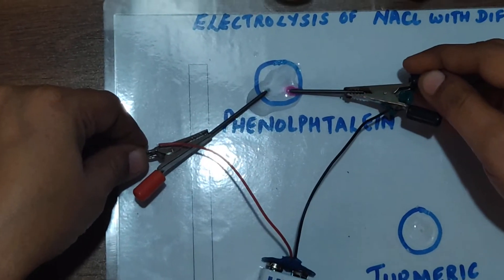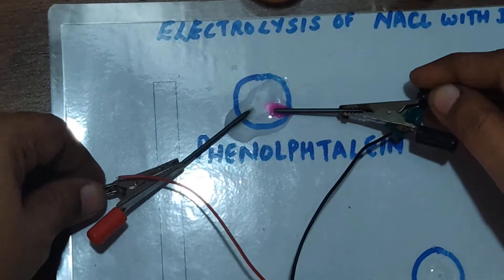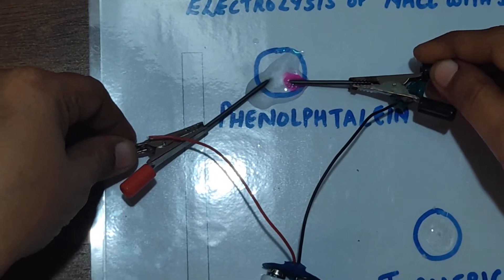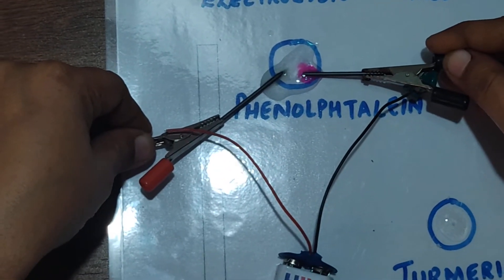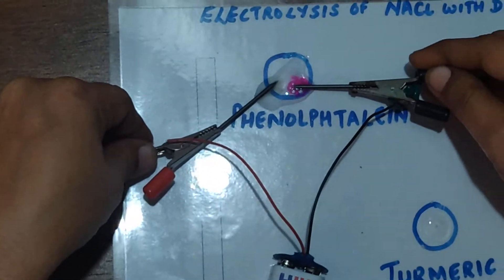See, you can beautifully see the bubbles and the pink color at the negative electrode. At the negative electrode, pink color appears because hydrogen ions are reduced to gaseous hydrogen.